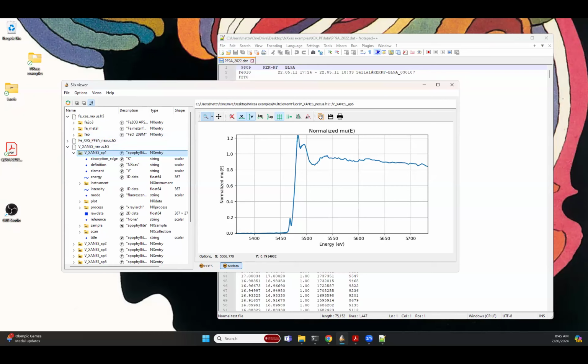Was more, for example, you collect 10 minutes of QuickXAFS with a Frahm monochromator where you got multiple scans up and down, up and down, up and down. And usually before you give it to the user, or at least you give the user the tool to process those data in order to give them separate scans. In the Nexus, should they appear as one single continuous multiple scan for the whole 10 minutes you are collecting, or should they appear as, for example, in your first example on the iron, each single scan as separate?